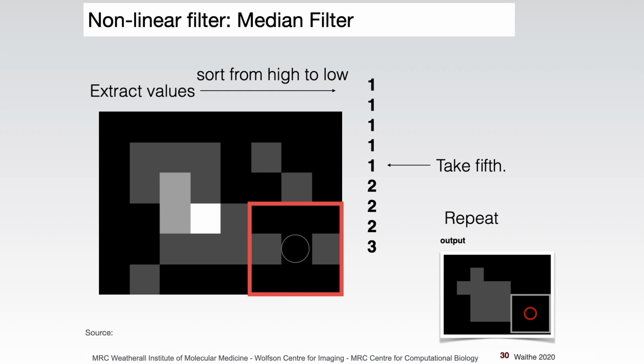So the reason I haven't gone into it too much is because there's no right way of doing it. But the reason I'm asking is if you have large images that are tiles, one tends to store the raw data, but it does mean that if you want to do anything like that to a tiled image, you have to stitch before you filter. Well, you mean filter before you tile, right? Well, I mean not to filter because you lose the edges. So in order to tile correctly, you need to tile first in 3D.